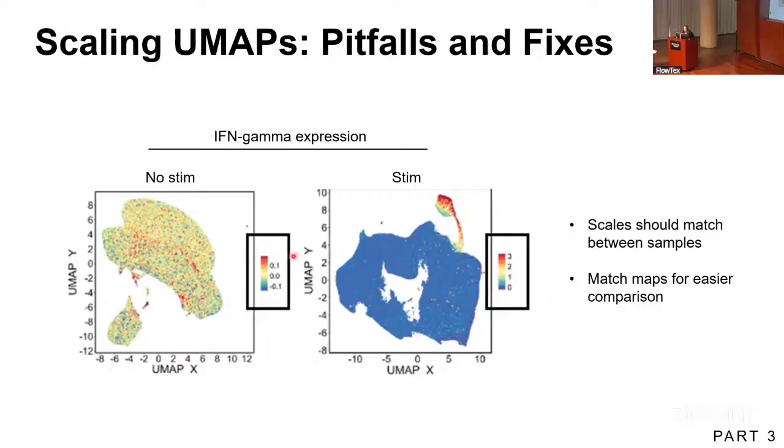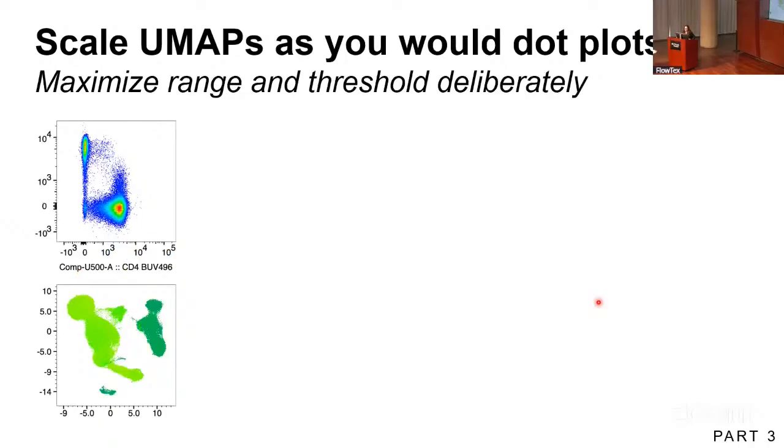Yeah, I'll also just add that it is not easy to scale heat maps in R. This was probably done in R. In my experience, there's not an equivalent of a bi-exponential scaling type of thing in R for UMAP. So if somebody has it all figured out, let me know.